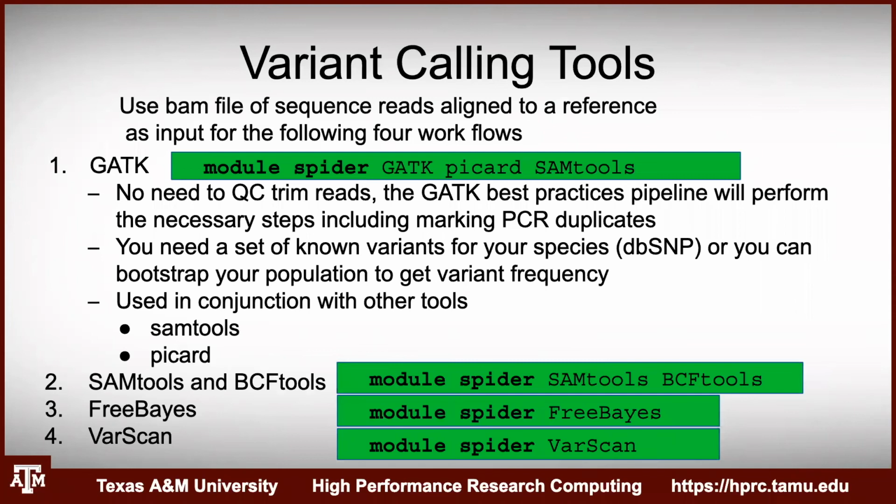All right. Here are some of the software tools that we have available to use. GATK is maintained by the Broad Institute, which is an institute partnered between, I think, Harvard and MIT, right? So it's a really world-class institute, and they are constantly maintaining this suite of programs.